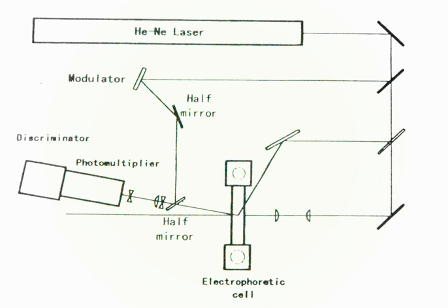The surface potential of the cell wall produces electro-osmotic flow. Since the electrophoresis chamber is a closed system, backward flow is produced at the center of the cell. Then the observed mobility or velocity from EQ 7 is a result of the combination of osmotic flow and electrophoretic movement.